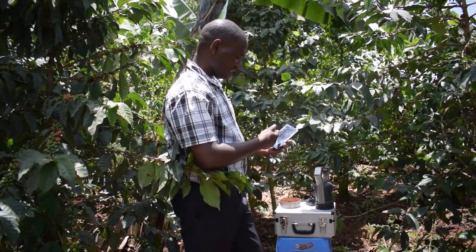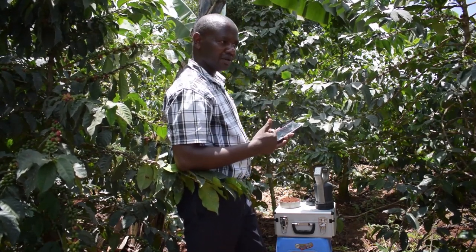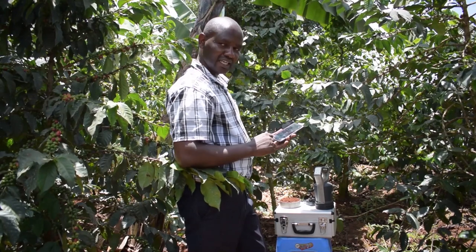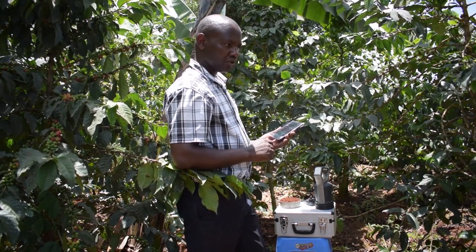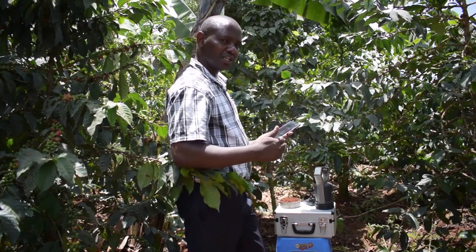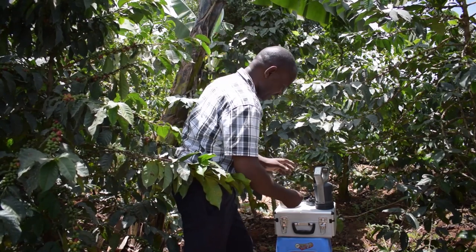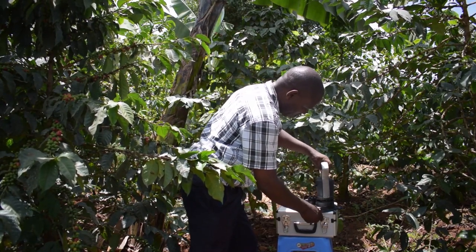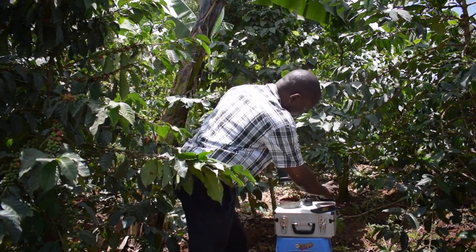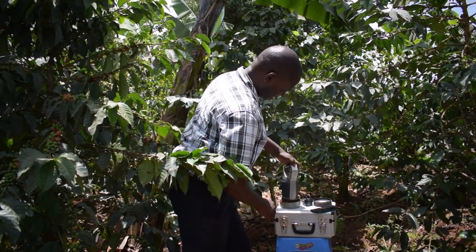We are through, and as you can see, the machine has a video so that the operator can see, and it has directions that are written. Whoever we have trained cannot make mistakes because total control of the machine is by the application. We are now getting into stage one — the analysis — and we put the scanner on the soil and press the scan button.